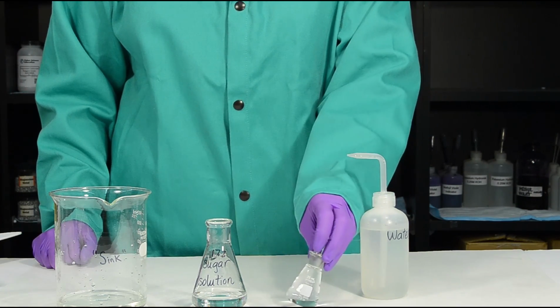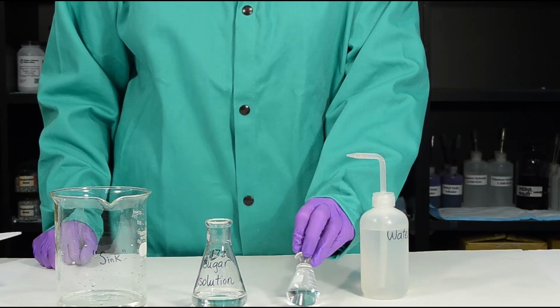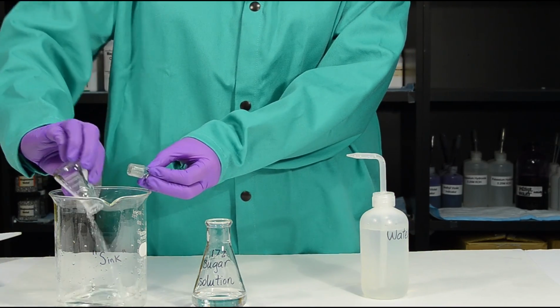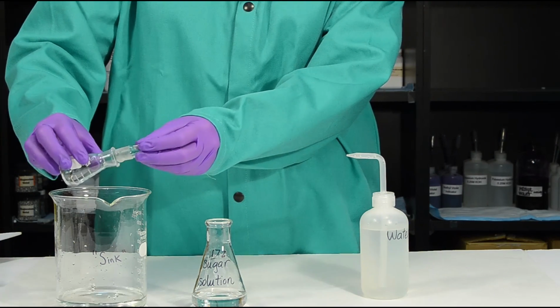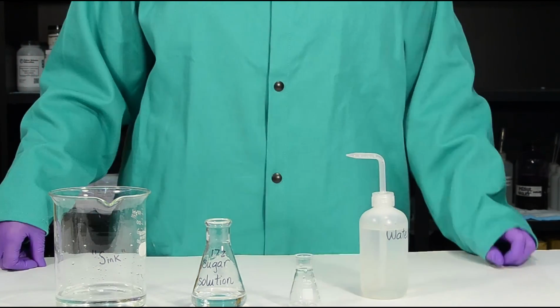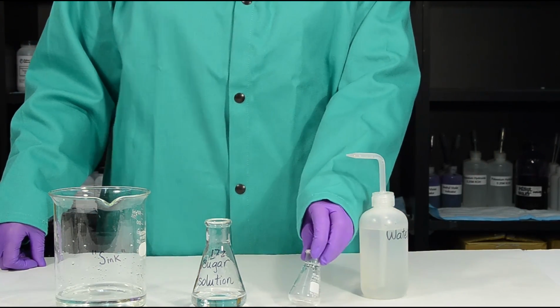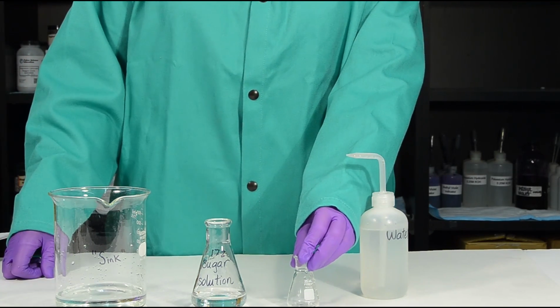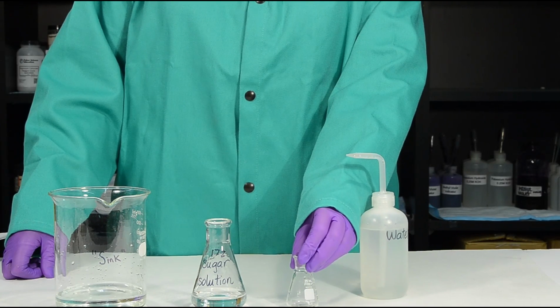Once your flask is dry, you can measure the mass of the flask and then dump it out and do your next solution. You should use the same flask throughout this entire experiment. You will repeat this process for all your solutions. Be sure that you rinse the flask again with each solution prior to finding the density of the solution.